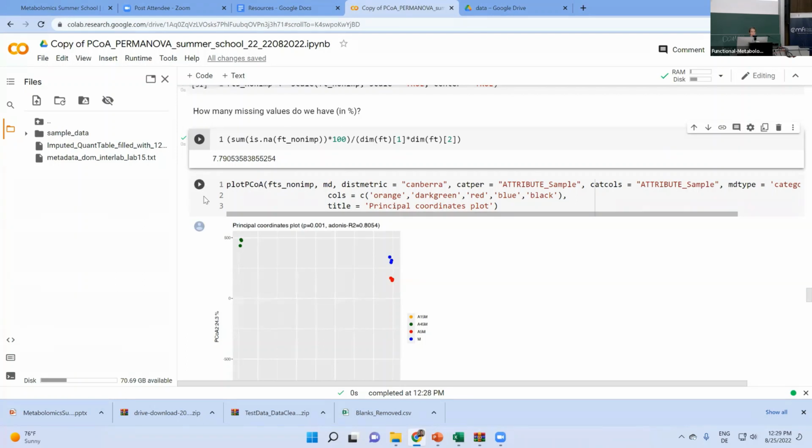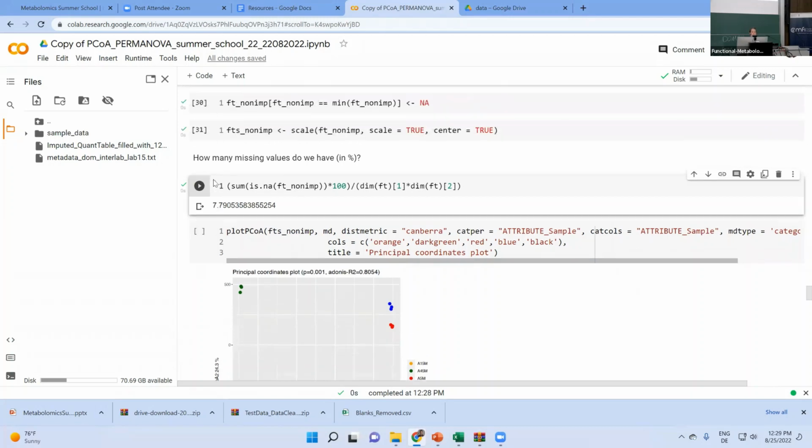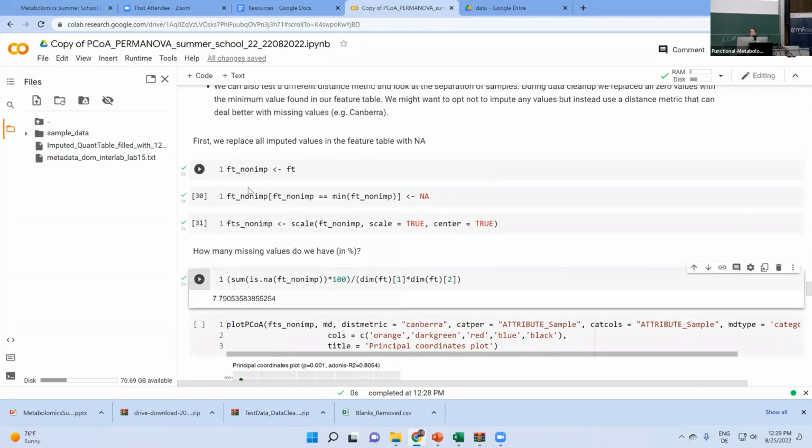Sorry? This is not using the computer control. Exactly, yes, that's just the gap fill. So another factor is that we gap filled during MZmine pre-processing. So that gets rid of some zero values already as well.